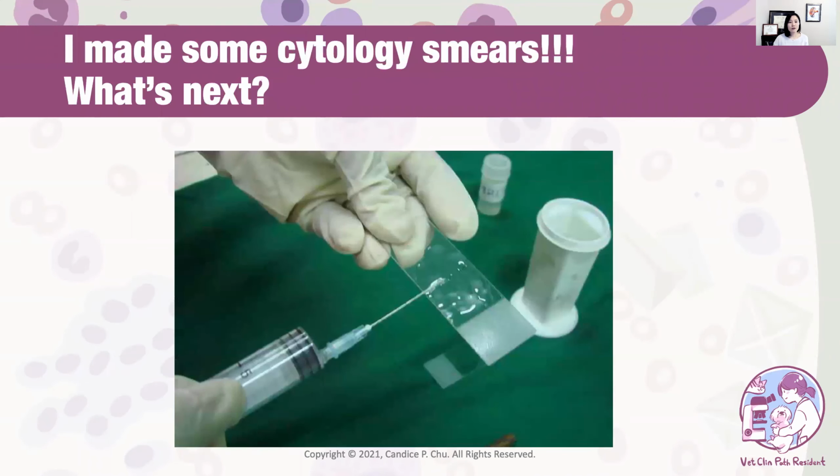So imagine yourself, you're a general practitioner working in the clinic, and there's a dermal mass on the dog. You perform the fine needle aspirate and you prepare several cytology smears. What would be your next step? So take a couple of seconds to think about that.